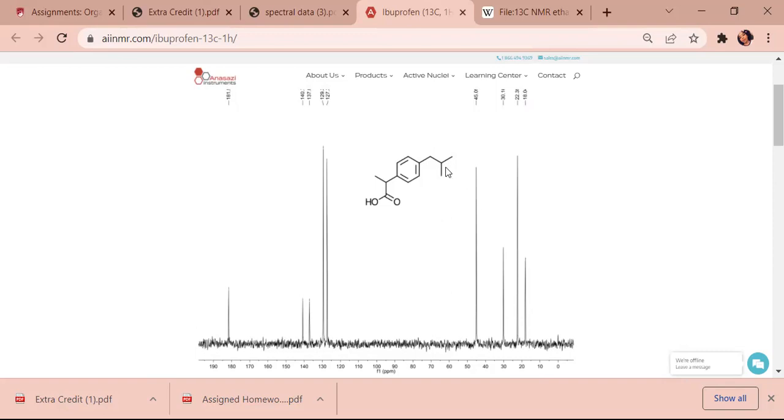So like I said, these two aren't really going to count because they are equivalent, but we do have that connection to this guy. So I'm going to say that this one right here is this one right here.